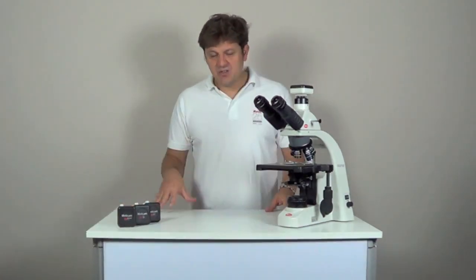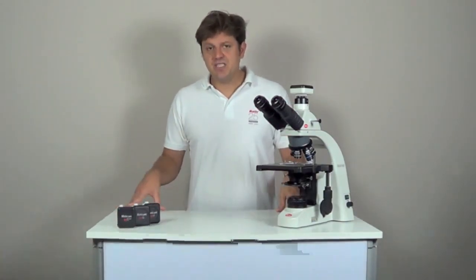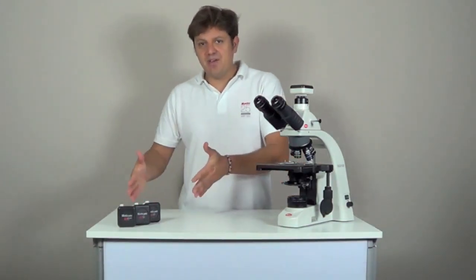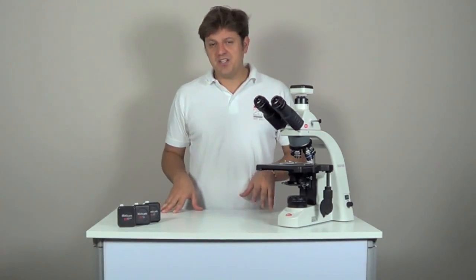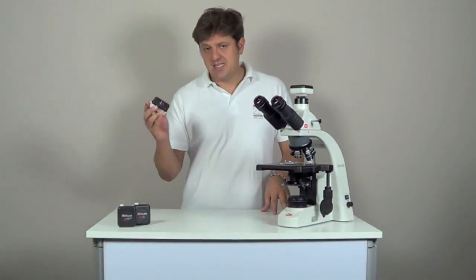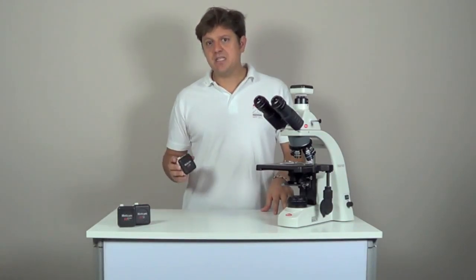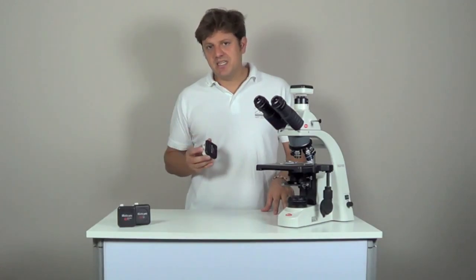Maticam 1SP has a resolution of 1.3 megapixels, more than twice as much as the Maticam 1. The advantage of this model is that most laptop screens also have a resolution of 1.3 megapixels, meaning the whole image is completely displayed on the screen. It is a very popular model in the education sector. Maticam 2 has a resolution of 2 megapixels, so in this group it is the camera that gives you most details.